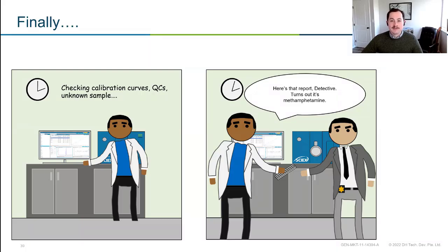When we think about LCMS, we want to think about separation. So we're always kind of focused on getting the separation, chromatographic resolution, for our compounds of interest. But really the question we always want to ask ourselves is, what question are we trying to get out of our data? Are we trying to be quantitative? What analytes are we interested in? That's really going to affect everything we do in the method development section and everything we do in how we process the data. So with that, I want to thank you very much, and I can take any questions.